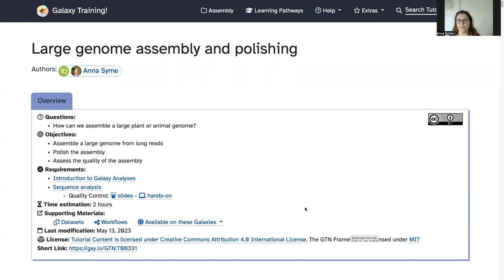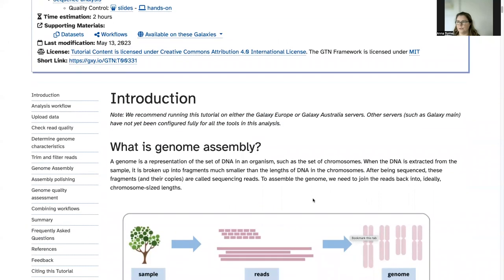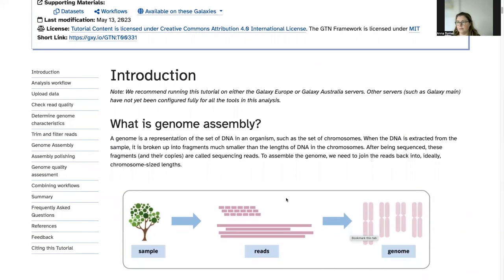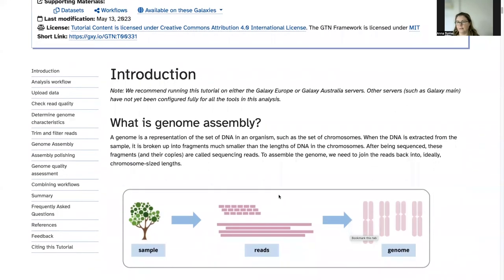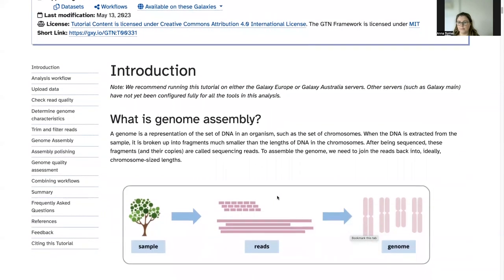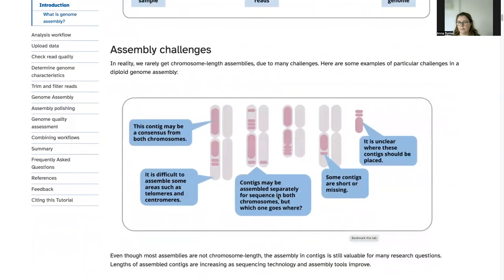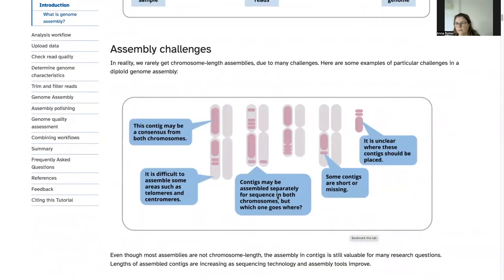Welcome everyone to this tutorial on large genome assembly and polishing. Here is the tutorial material, and while I'm showing this tutorial I'll have this open in a different window and show you the steps I'm following in the Galaxy window. In this tutorial we're looking at what genome assembly is, and I recommend reading the introductory material if you're not familiar with some of these concepts. We'll be looking at some of the challenges in particularly assembling these large genomes back into what we are hypothesizing as their original chromosomes.